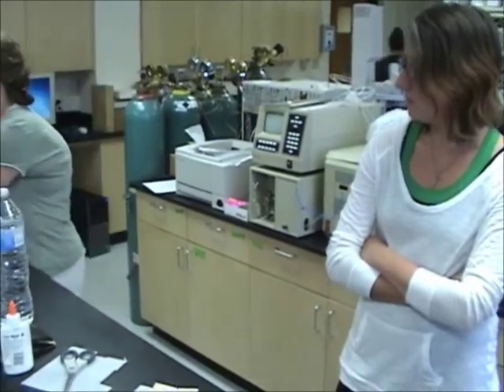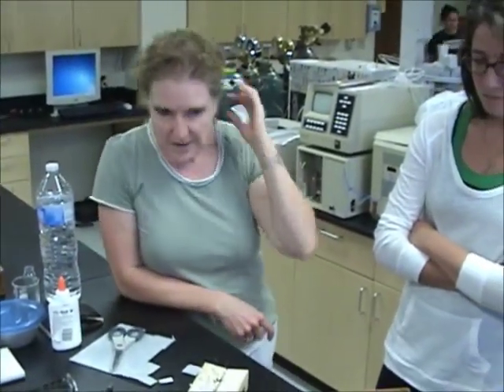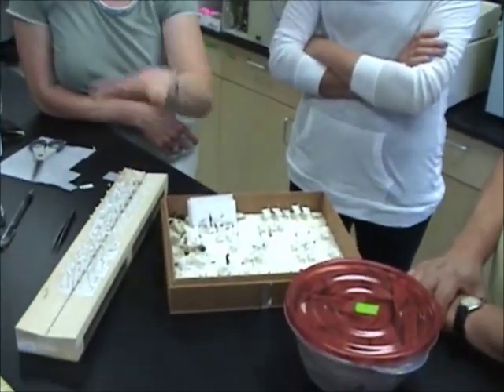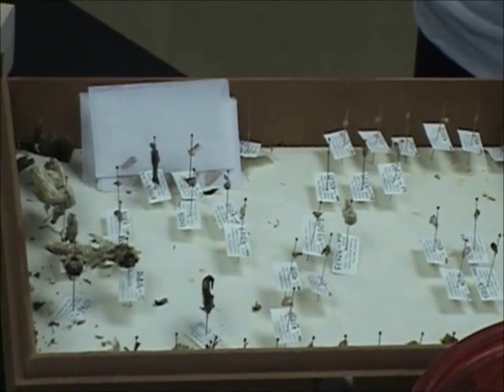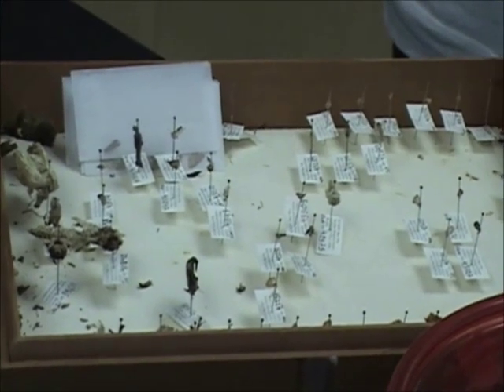There are different people involved. Some of these are getting shipped to Jan Miller, who is an expert on some of this stuff and is now in Washington State. Some are getting shipped directly for at least initial ID — at least down to the family level, so you can say these are all geometrids, or these are all noctuids, or whatever. Then they'll be spread and pinned and logged into the database.